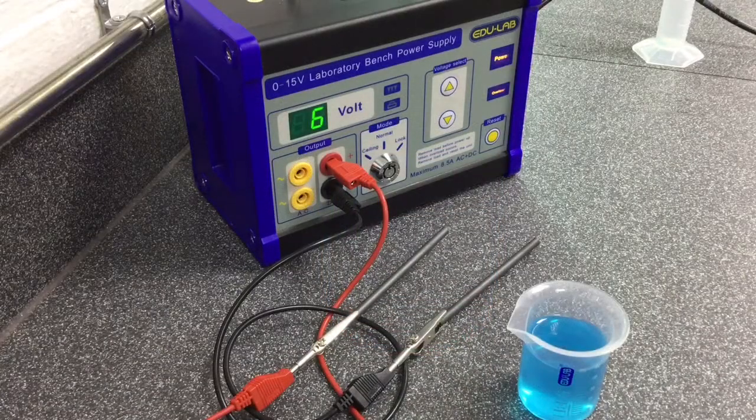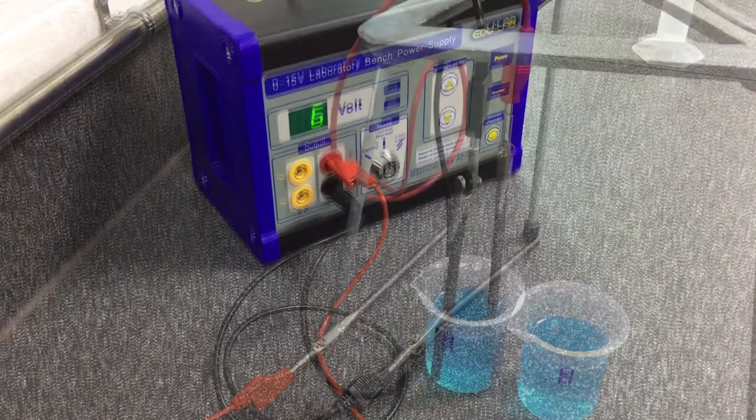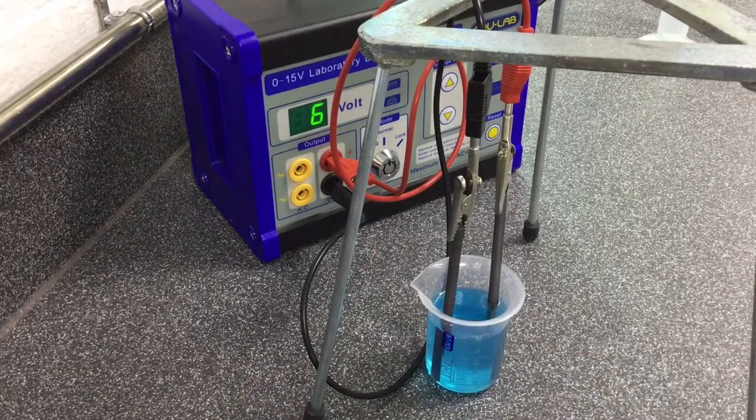The experiment requires a simple circuit with the power pack set to 6 volts and the leads connected to the graphite rods using crocodile clips. The graphite electrodes are inserted into the copper sulfate solution. This completes the circuit as the ions in the solution are free to move and carry the charge.